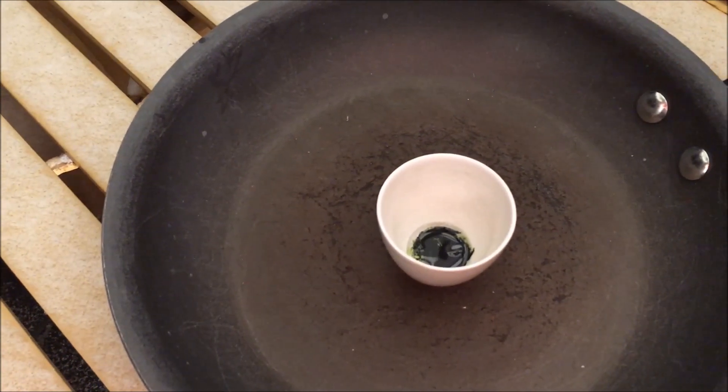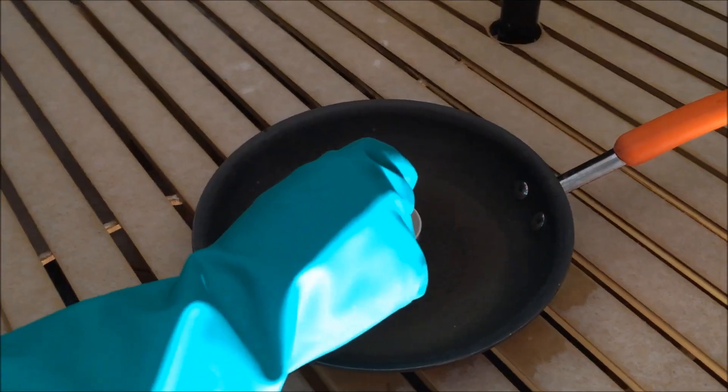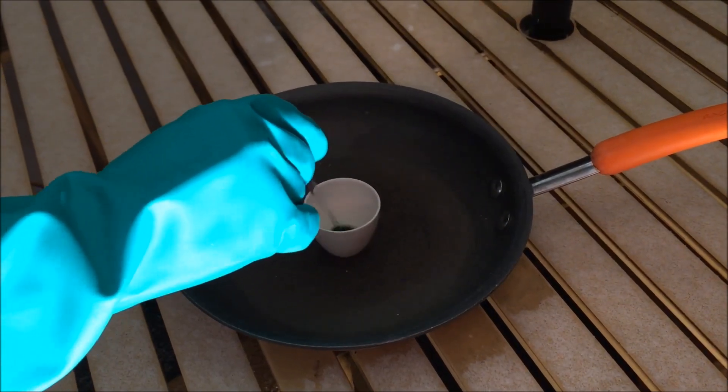Immediately, you should see a greenish colored oil at the top of the liquid. You can give it a stir to make sure everything has reacted.